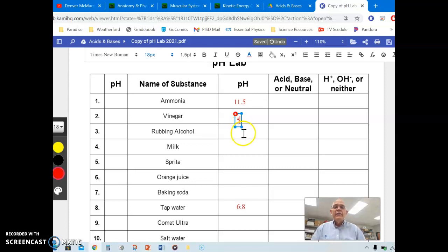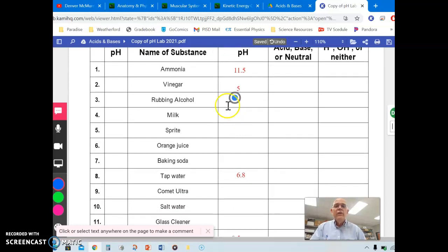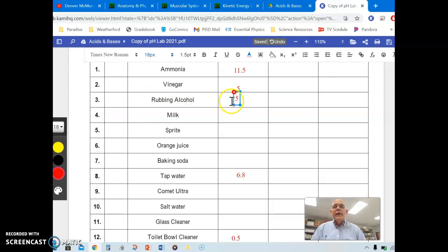11.5, 5 for vinegar, 5 for rubbing alcohol. So I'm just going to read these out, and then you can type them into yours. Milk was 6.5 to 7, but we'll go with 6.5. Sprite is 5. Orange juice is 5. Baking soda is 8.5. Tap water is 6.8. We did that one already, so let's say 6.8.